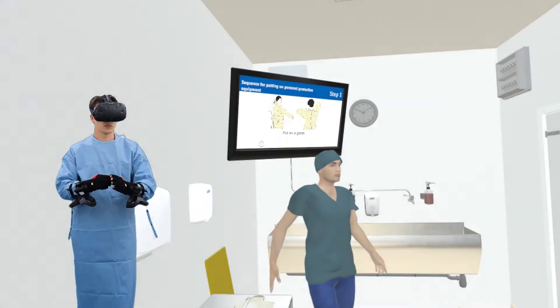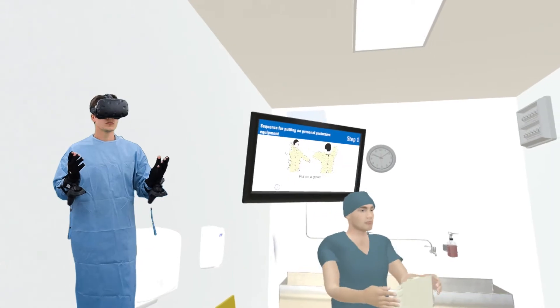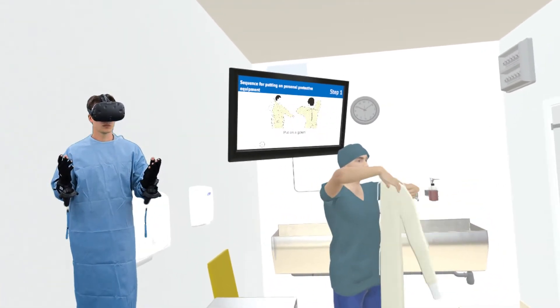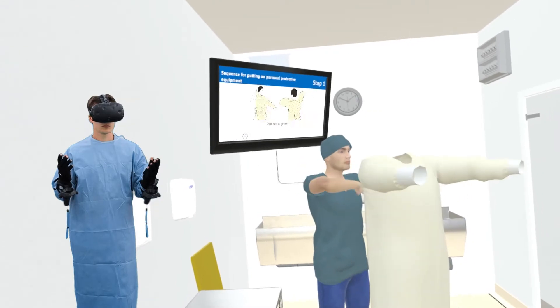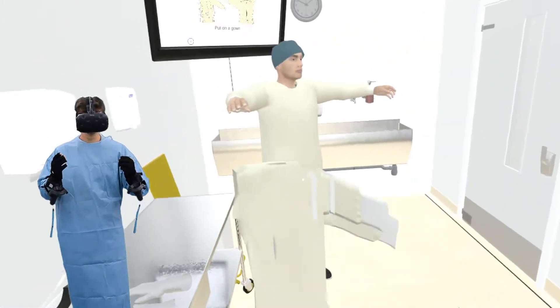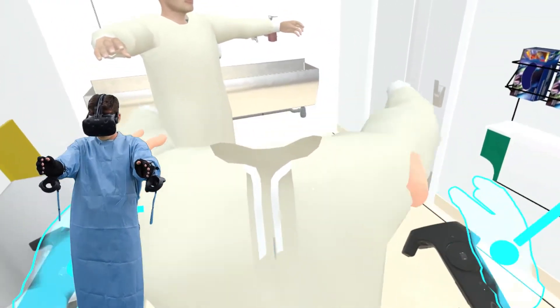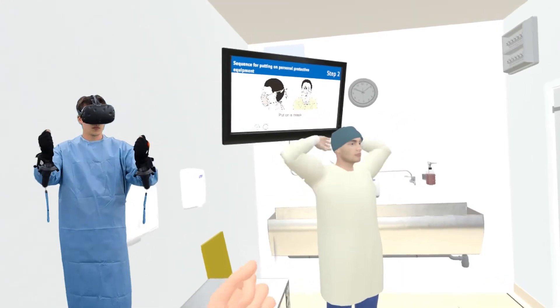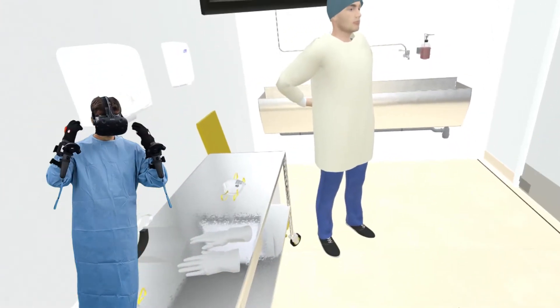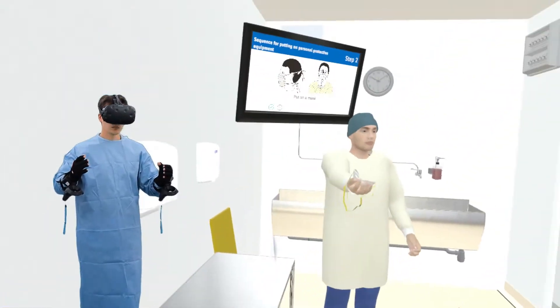Inspect your equipment for any damage prior to donning each piece. Clean shaven, don your gown. Tie around the neck and around the waist. Secure gown using a bow that can easily be untied. Ensure all clothing is covered by the gown.